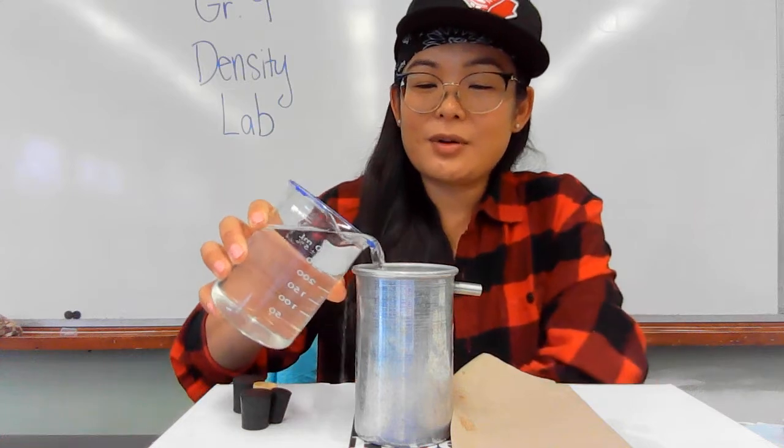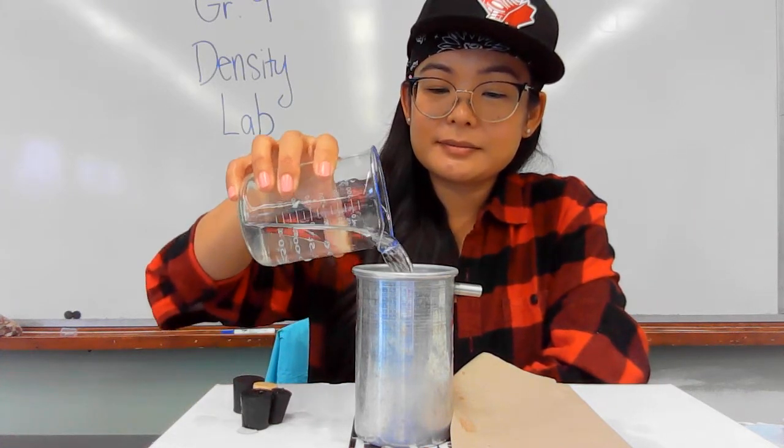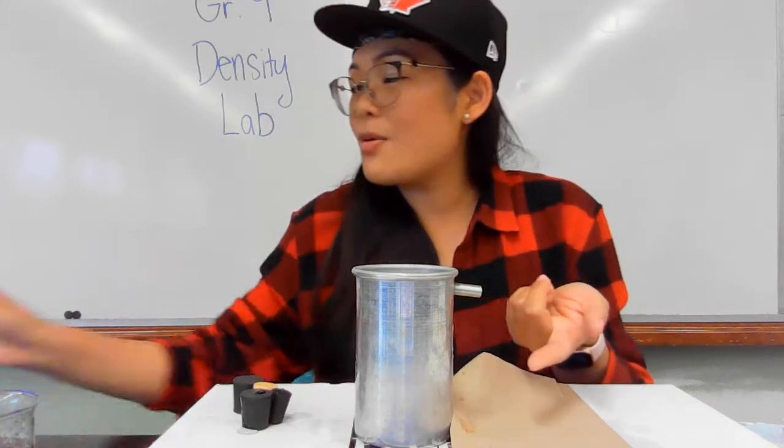So I'm just going to pour the water in. Oh, we're making a mess. No overflow yet, nothing's dripping out. So I'm going to add a little bit more water.